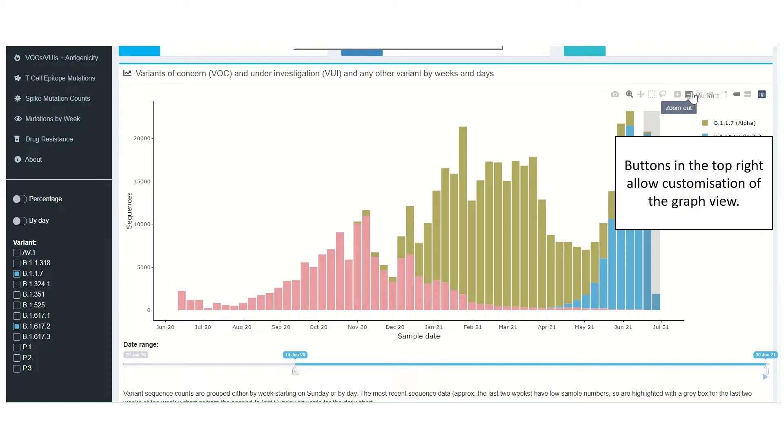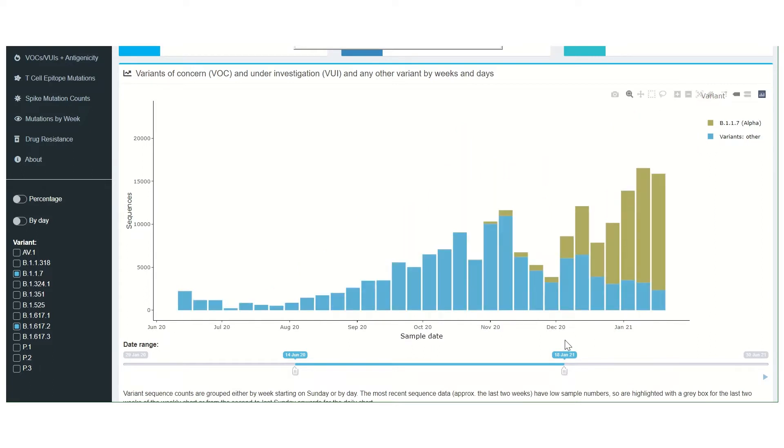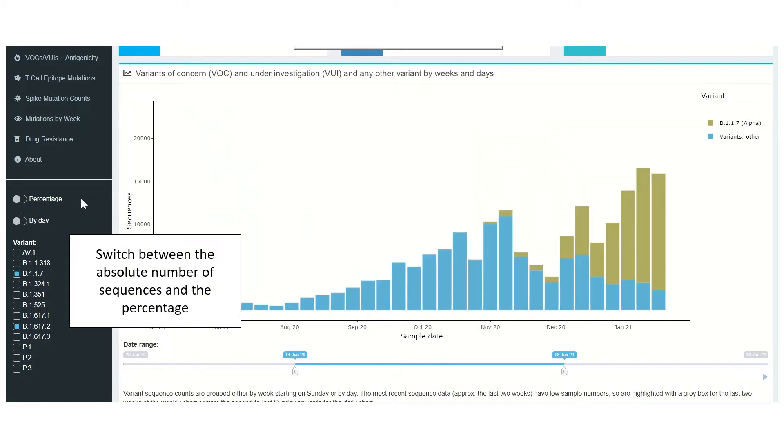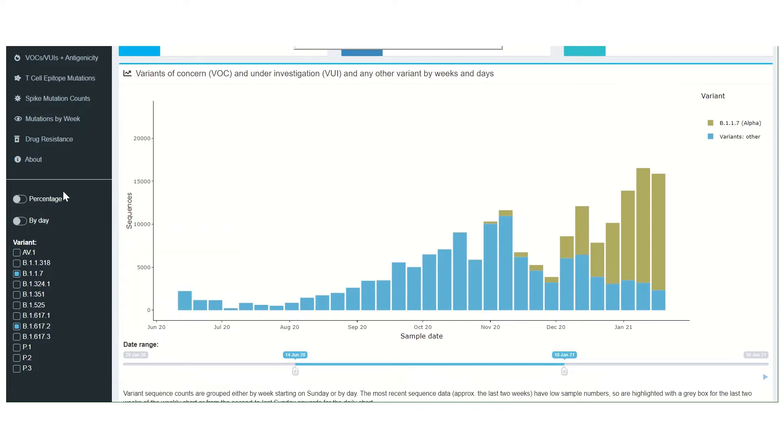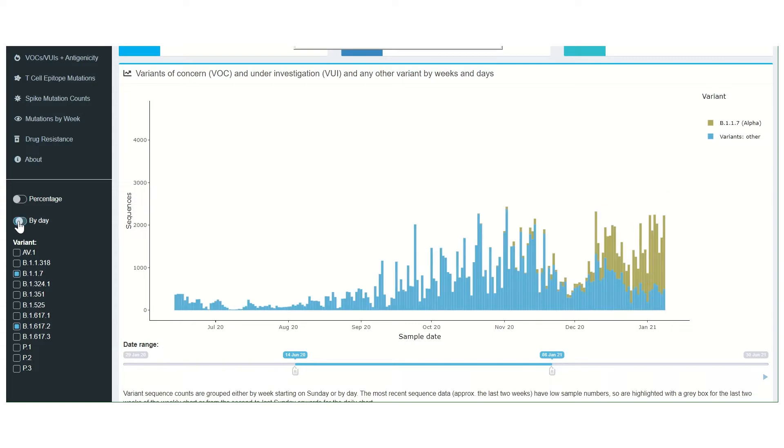Buttons in the top right allow for customization of the graph view and the period for which data is shown can be adjusted using the slider along the bottom. Toggle buttons on the left can be used to switch between the absolute number of sequences of a variant and the percentage of the total that they make up, as well as between daily and weekly data.